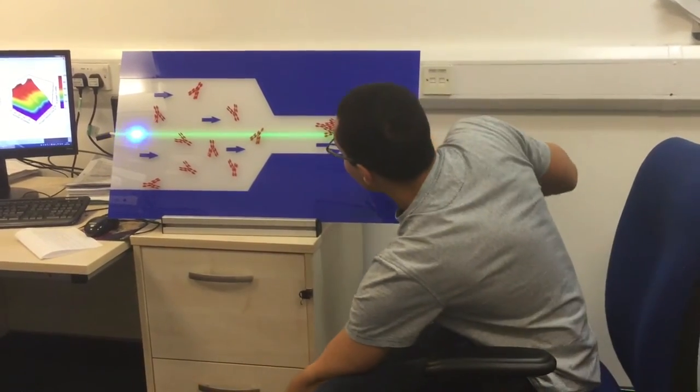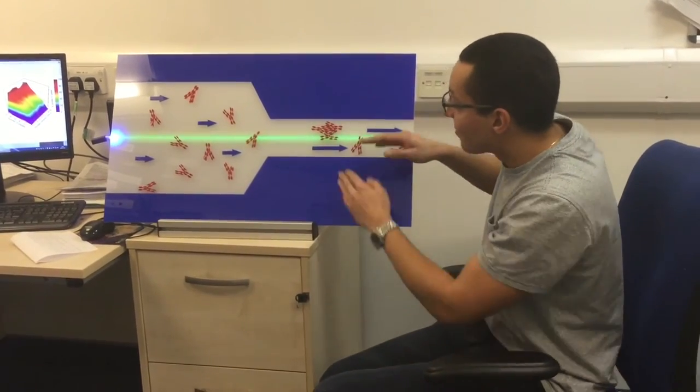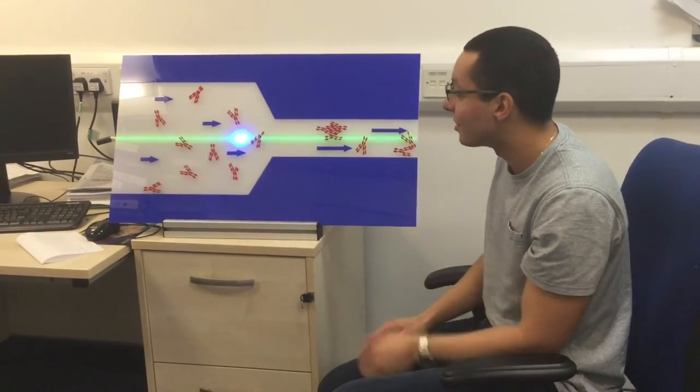And then in our capillary here, we have a high shear region. So we have a shear flow where we have layers of fluid traveling at different speeds, which may influence the aggregation.